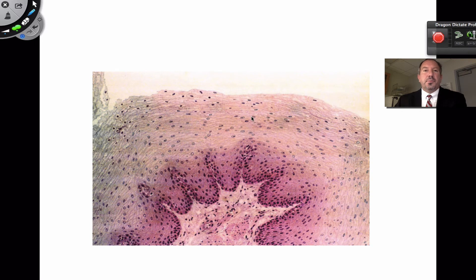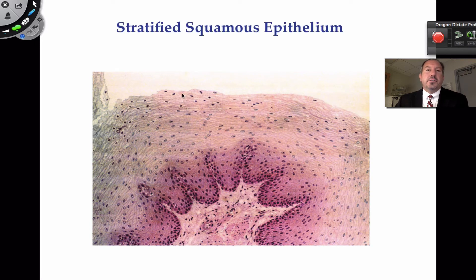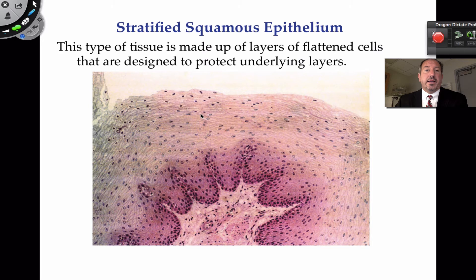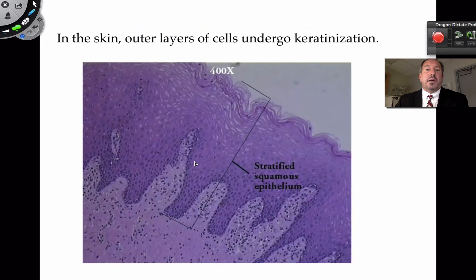This particular tissue is called stratified epithelia because there are many, many cell layers. You'd find this on the outside of your skin. This isn't great for diffusion — it's great for protection. See how the cells are very squamous, flat, tile-like, like pancakes. This is very good for protection and it's found in the epidermis of the skin.